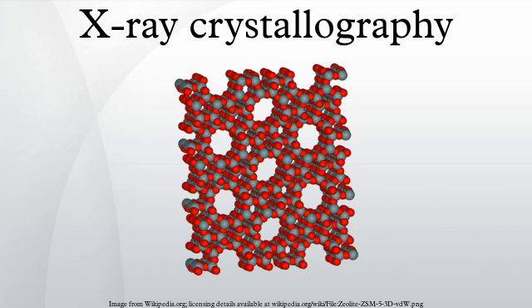Heavy atom methods. If electron-dense metal atoms can be introduced into the crystal, direct methods or Patterson space methods can be used to determine their location and to obtain initial phases. Such heavy atoms can be introduced either by soaking the crystal in a heavy atom-containing solution, or by co-crystallization. As in MAD phasing, the changes in the scattering amplitudes can be interpreted to yield the phases. Although this is the original method by which protein crystal structures were solved, it has largely been superseded by MAD phasing with selenomethionine.